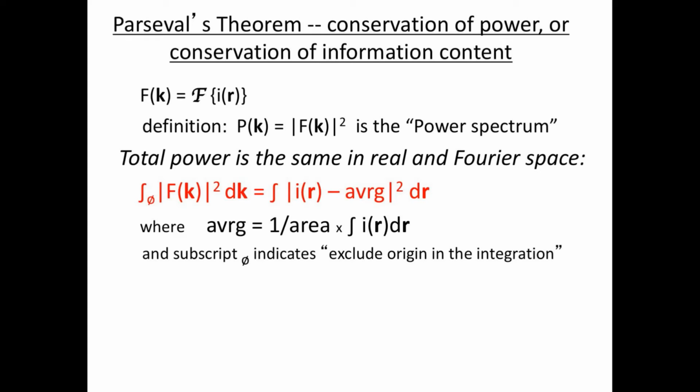That's important because if you have the Fourier transform of an image, and we want to enhance the signal-to-noise ratio, then we could say, all right, there's only information out to a certain point in Fourier space, and anything outside is noise.